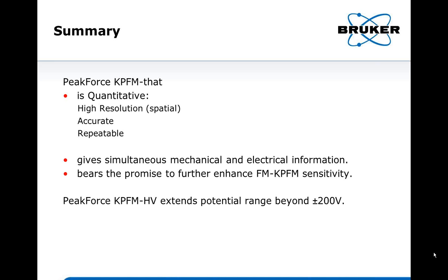And there's a lot more to PeakForce tapping mode. We have webinars and presentations on PeakForce tapping by itself. Yeah, that's a good point. PeakForce KPFM, is it using lift mode? Yes. For all the PeakForce-based KPFM modes, we use lift mode.